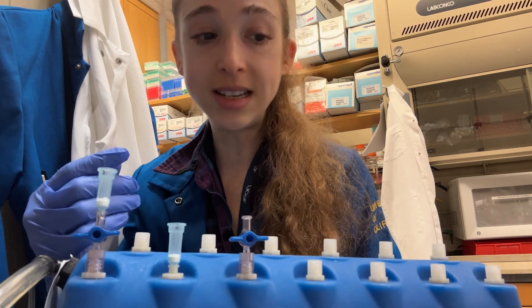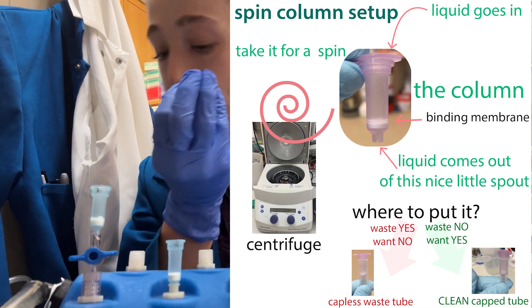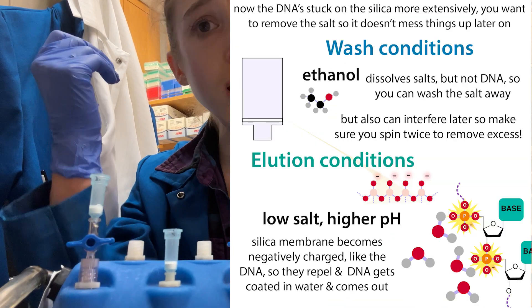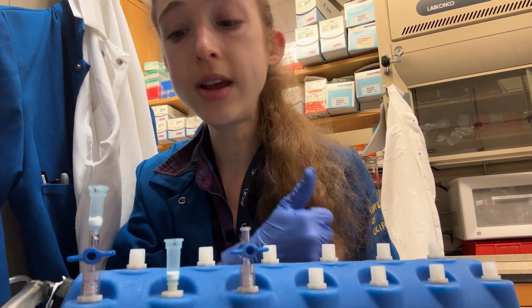Do that centrifuge spin to dry things out in your waste reservoir, then transfer it into your sample collection tube. Add your elution liquid, let it sit a minute, and let it spin. And then you can have a DNA purification for the win.